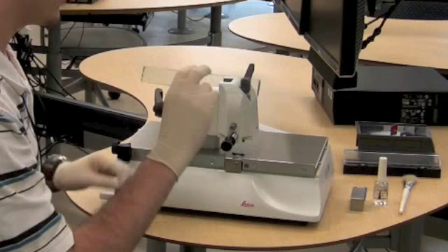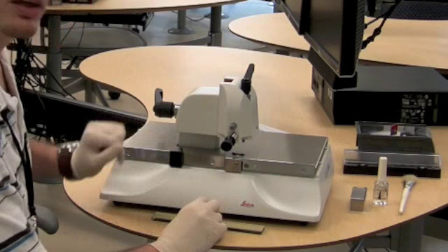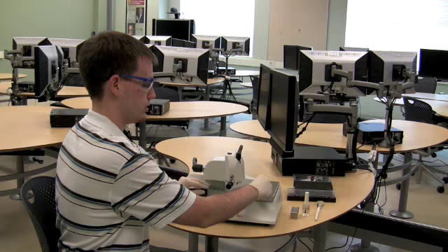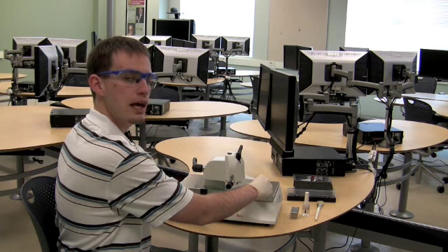So what we need to do here is move our movable stop to the next stop point on the front stop. And we're going to take the piece of glass from the right side and place it back onto the instrument. Now what we're going to do with this, again, is just repeat the steps that we previously did.